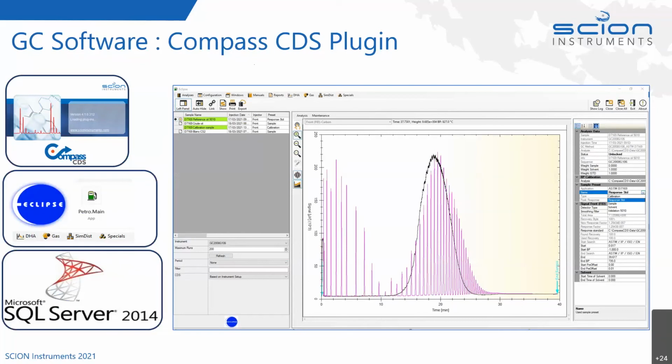crude oil distillation, including this from the DHA. It's all handled by the Eclipse software, the plugin itself. Behind it, it's got a Microsoft SQL Server database that will hold the retention times, the Kovats indices, and the properties of all the hydrocarbons that will allow it to automate the reporting.